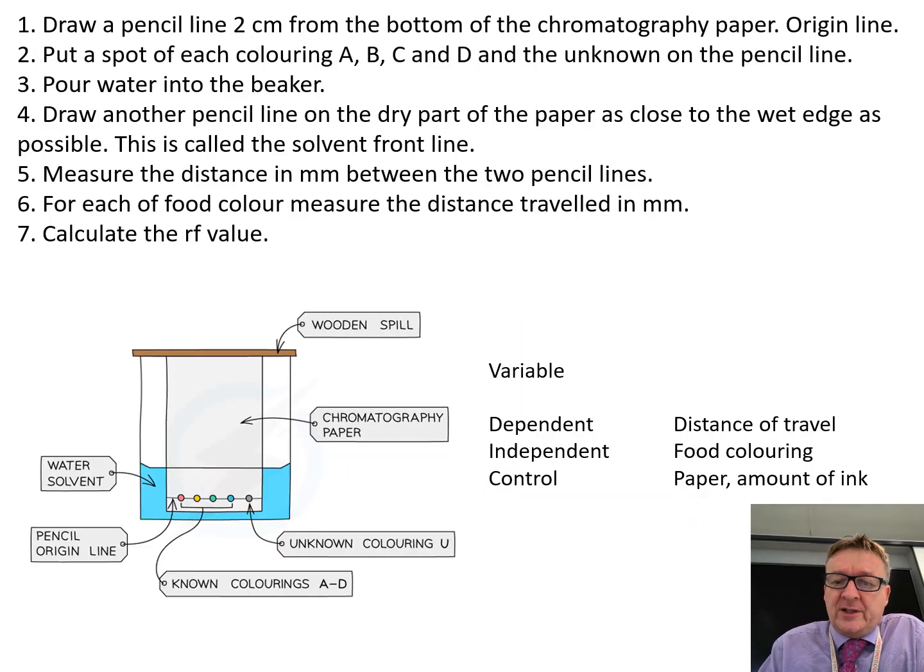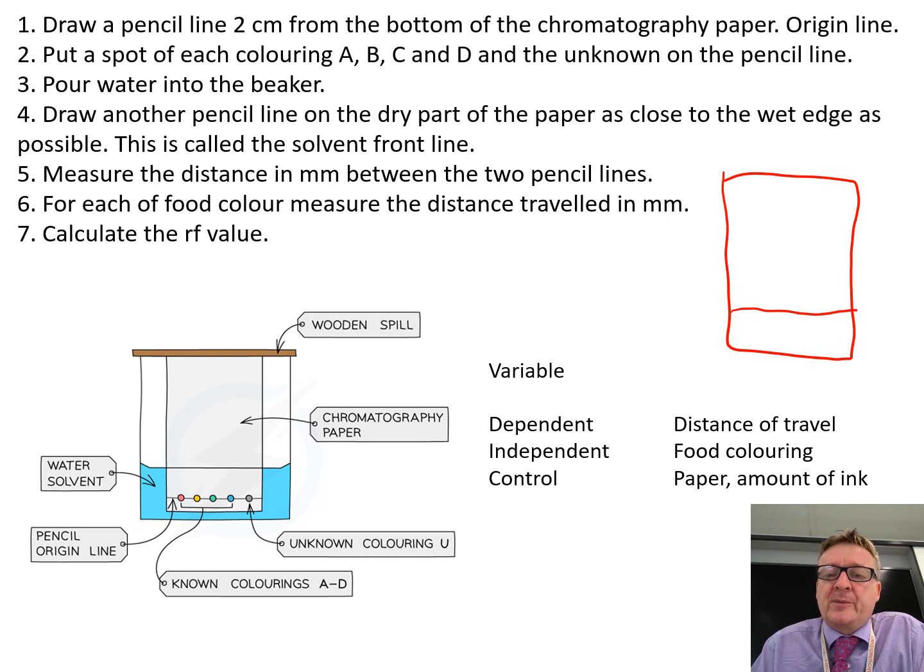What you do is get your piece of chromatography paper and draw a pencil line two centimeters up from the bottom. That is called your origin line. Make sure you're doing it in pencil because if you do it in ink the ink itself could move.